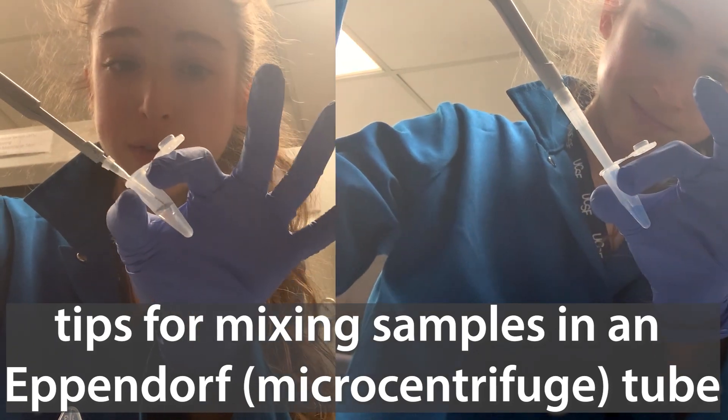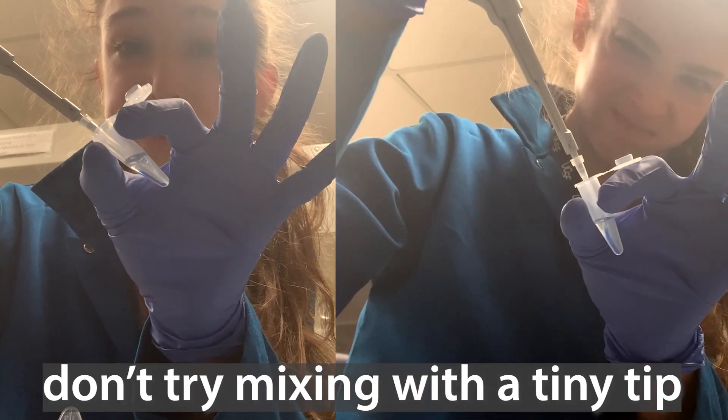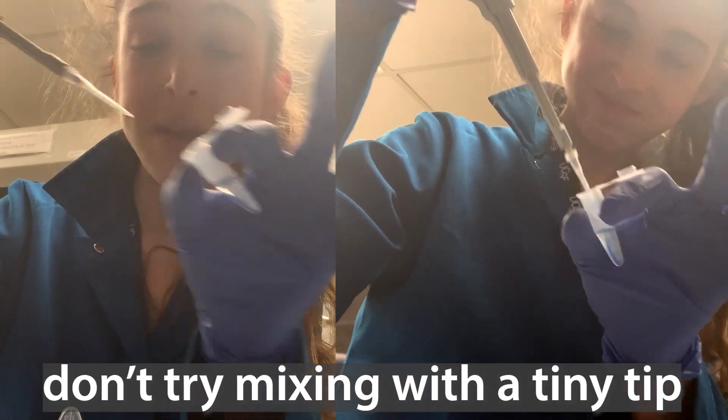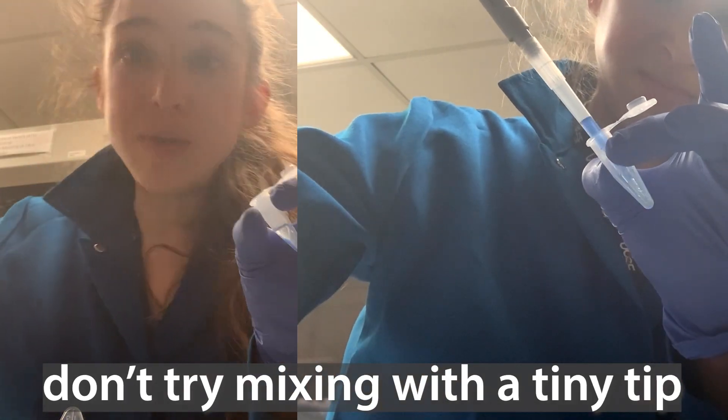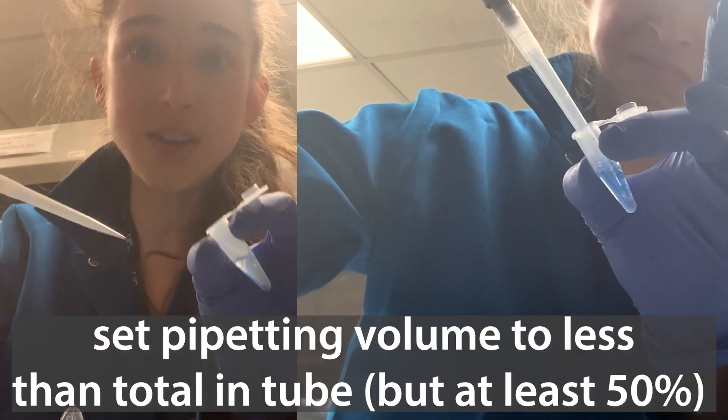If you're mixing samples in an Eppendorf tube, you want to make sure that you're mixing with the right tool. Don't try mixing with the tiny little pipette tip, but also don't overdo it. You want to take a bigger pipette tip, but you want to have it set to a lower volume than you actually have in the tube.